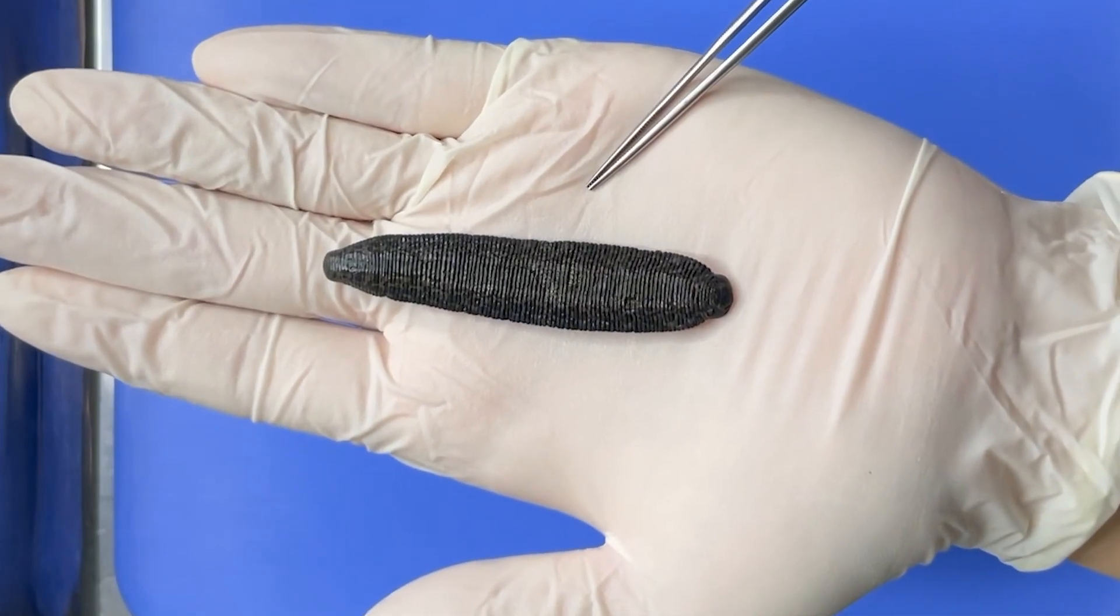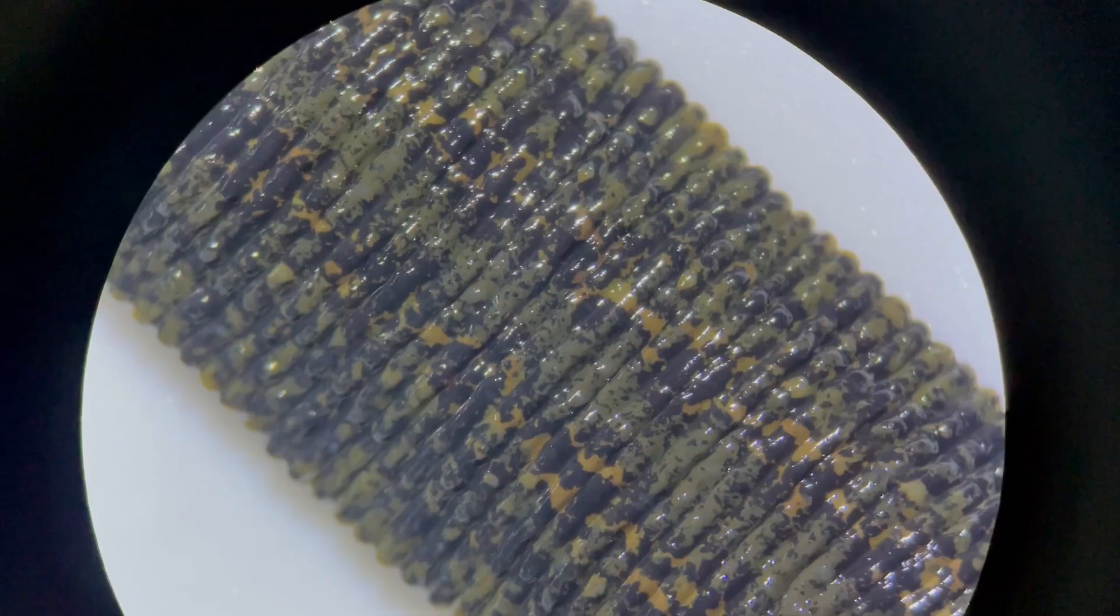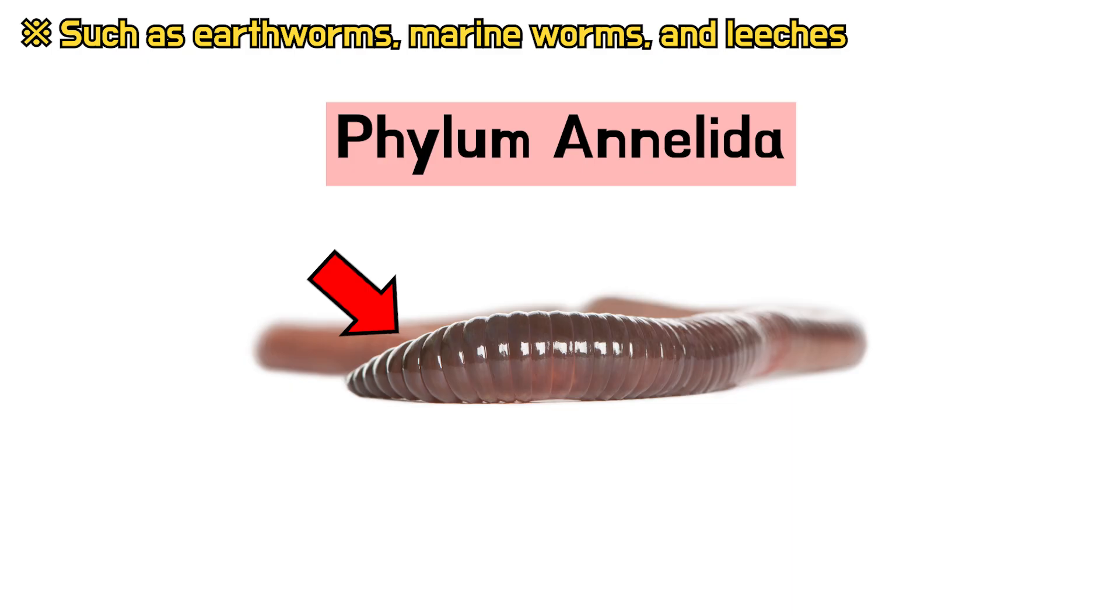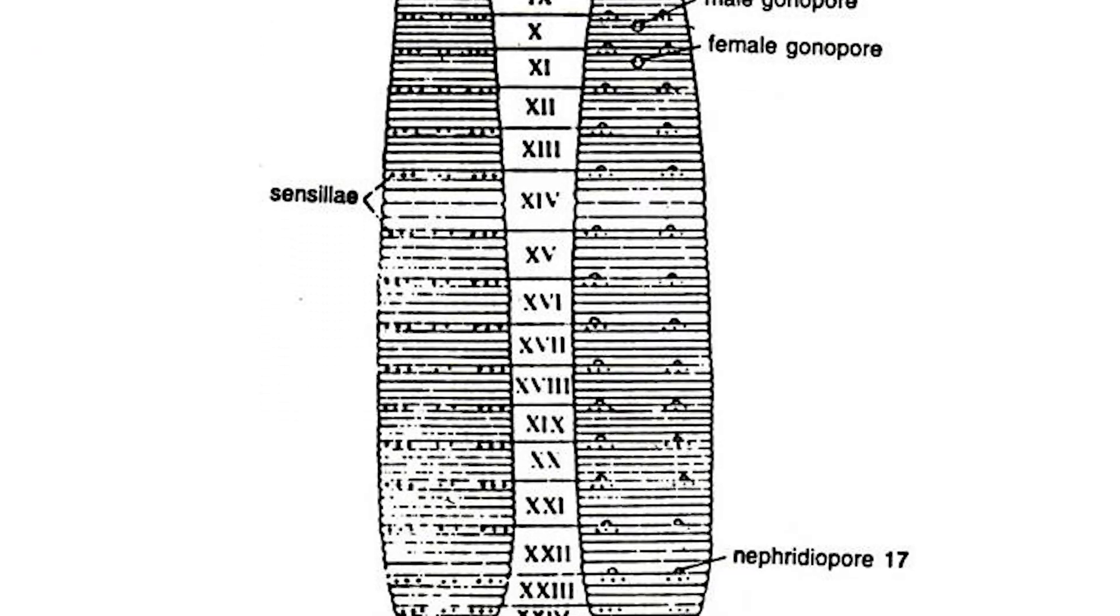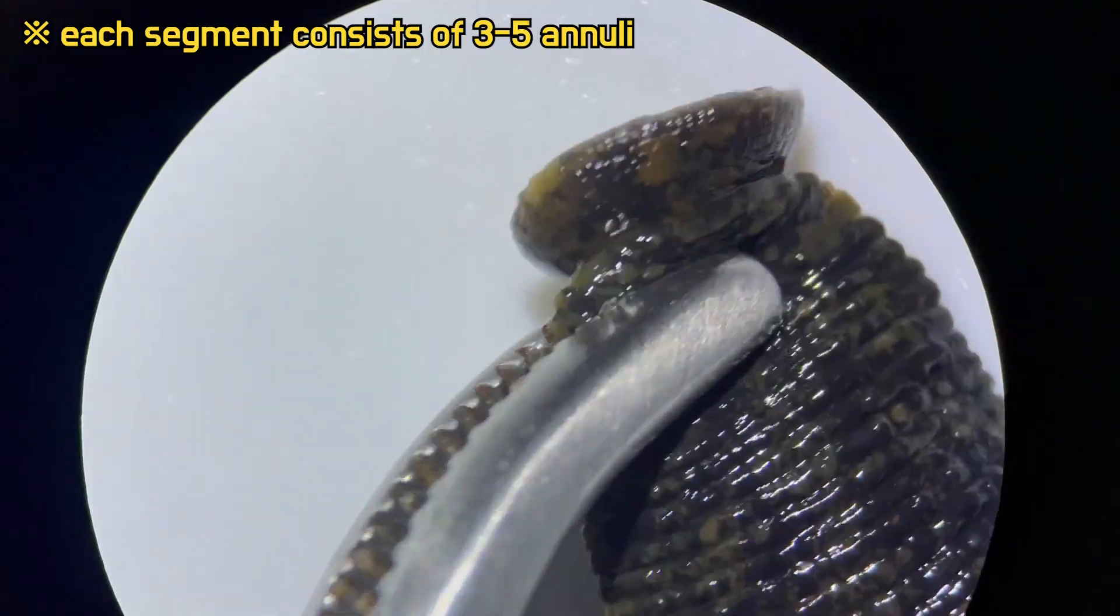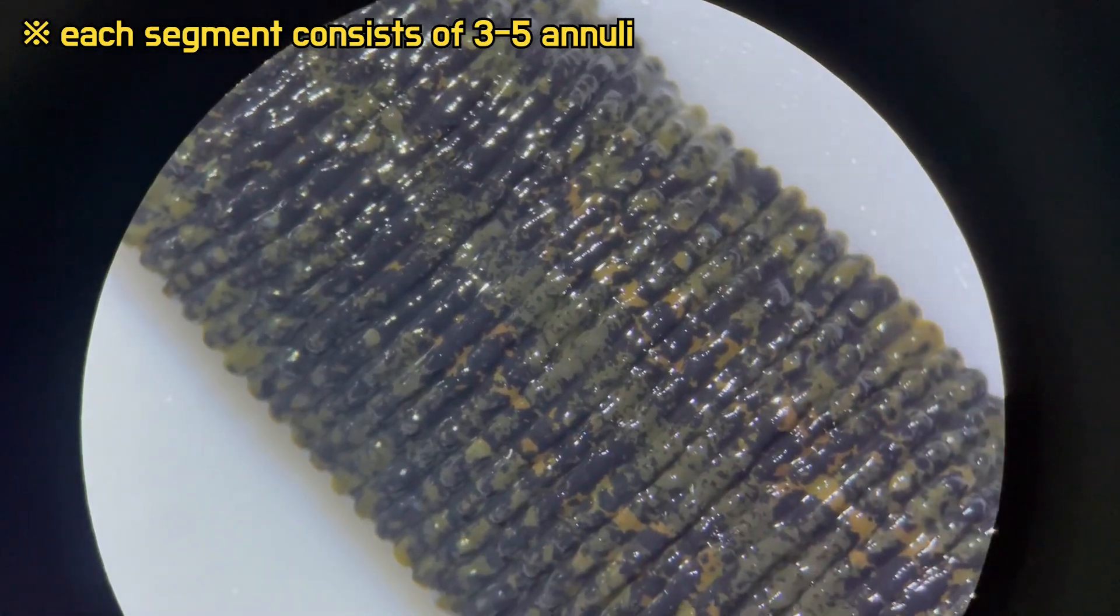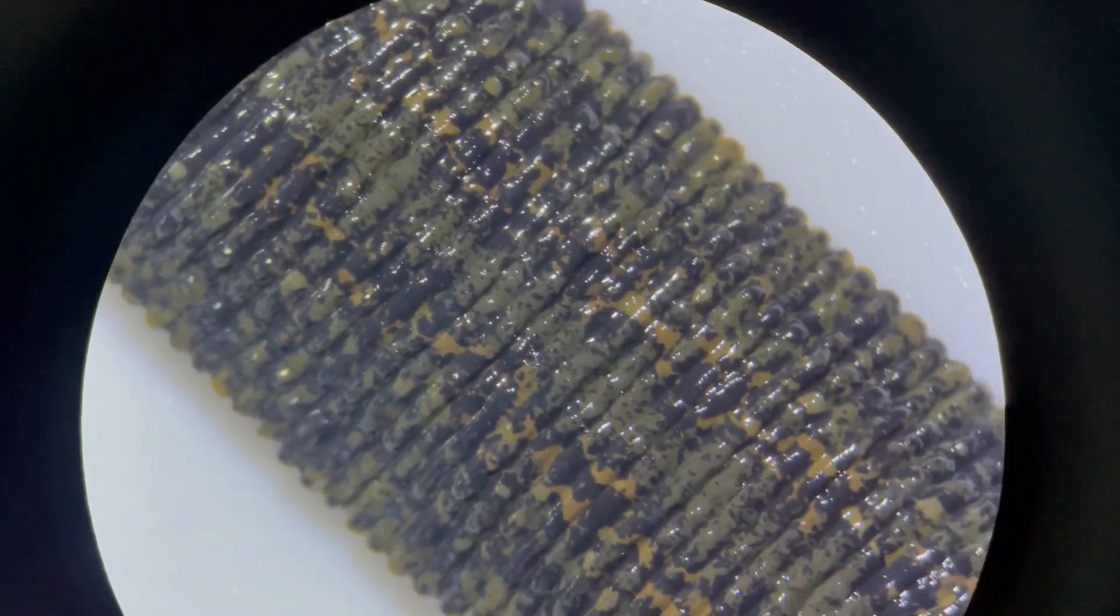First, let's take a closer look at the leech's body. Their body is divided into numerous ring-shaped segments. This is a characteristic feature of annelids. The actual body of a leech is composed of 33 segments, but each segment is further divided into multiple annuli, resulting in a large number of segments.